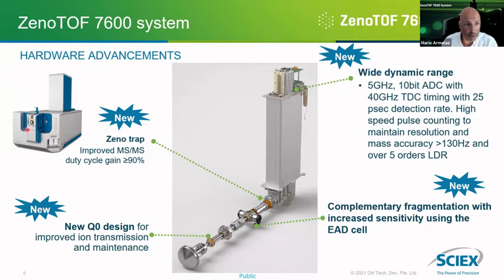Just one comment, the ion source you see here is not the default ion source. This is the OptiFlow for microflow and nano configuration. So typically for lipidomics, most likely you would use the default Turbo V configuration. In this new system, you can acknowledge the QTOF design.